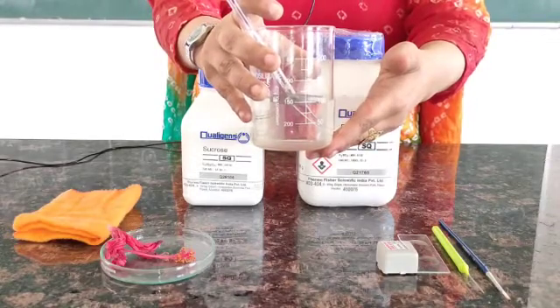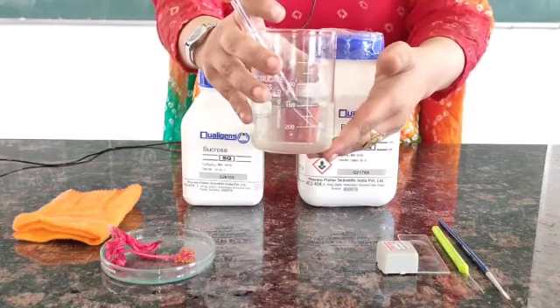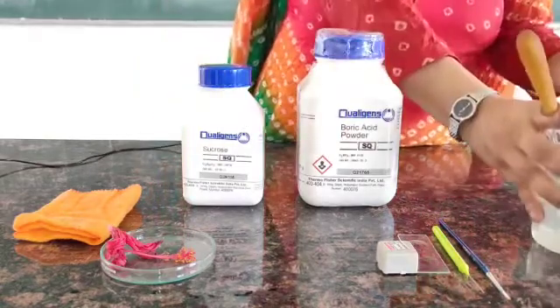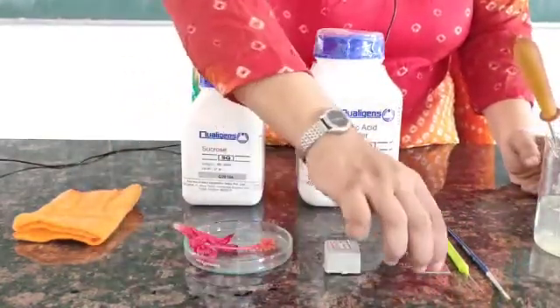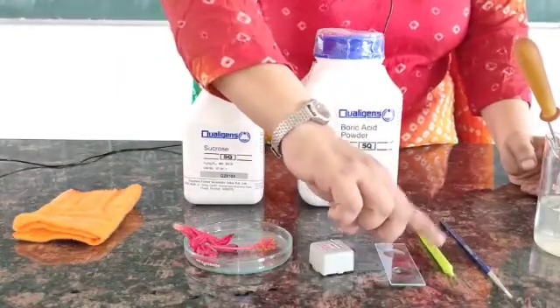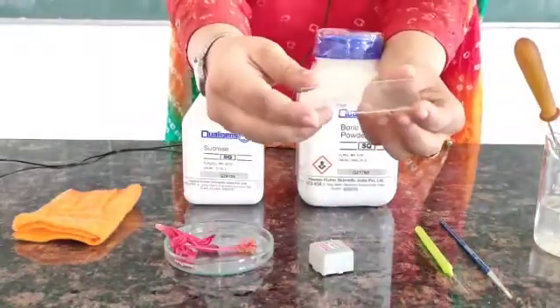Because we are carrying out this experiment in the laboratory, we require the nutrient medium so that pollen germination can take place. We also require a fresh flower, cover slip, cavity slide, needle, and brush.